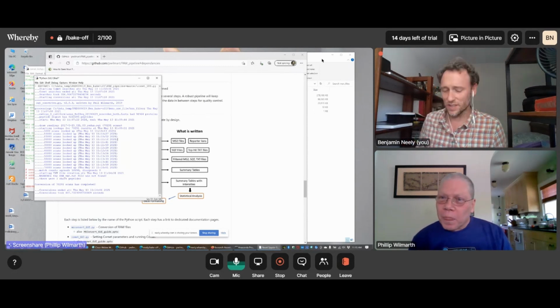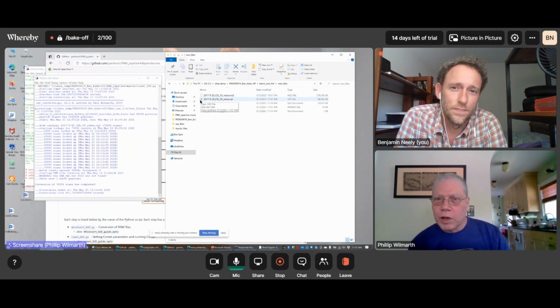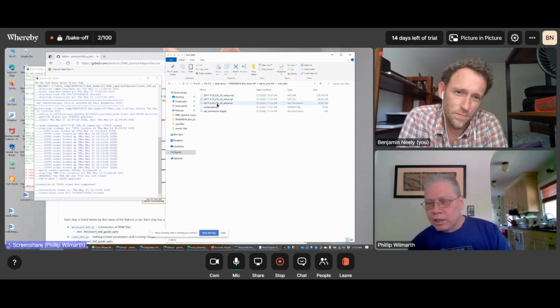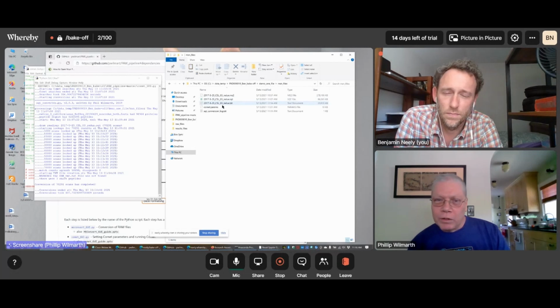No, good to know. Really good to know. So what we now have over here, the MS2 file is basically the peak list that we started with. When Comet ran, it wrote out this companion file, SQT, sort of a sequenced results format. And then we read that, find those top hits, and then look them up in the FASTA database to make sure that we've got protein accessions for all of the matches. And that gets summarized in a top hit TXT file. And everything now is basically going to be just working with this top hit summary file instead of anything else.